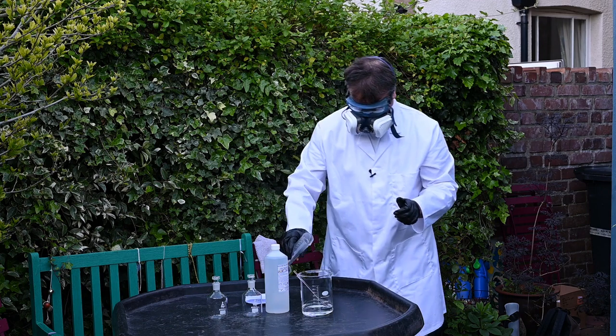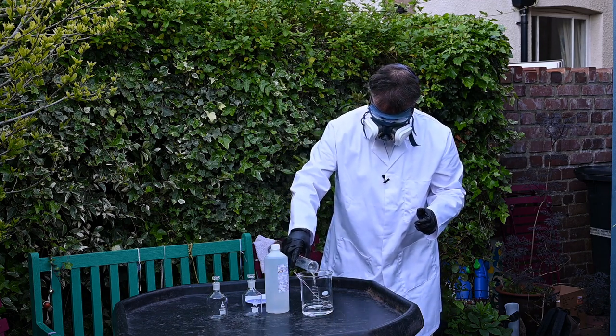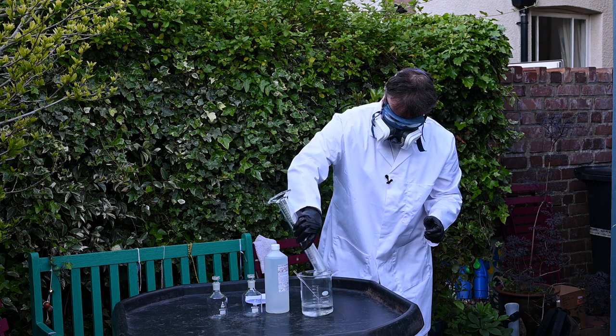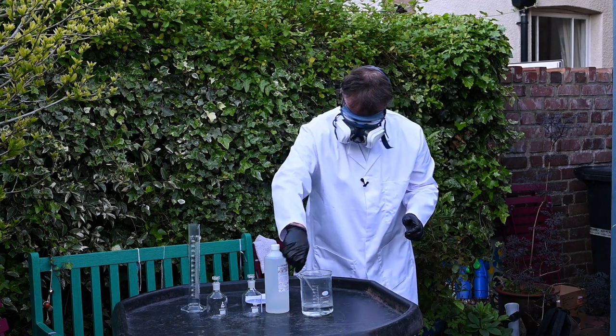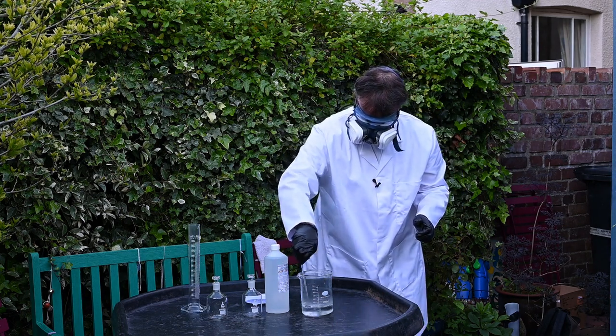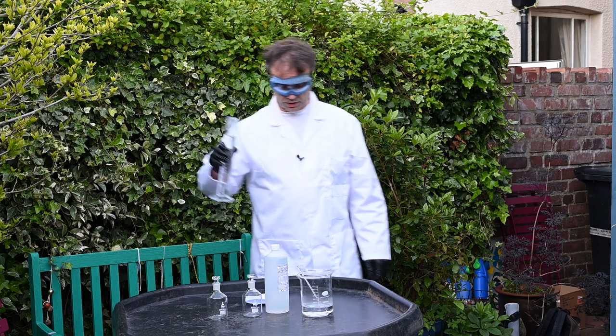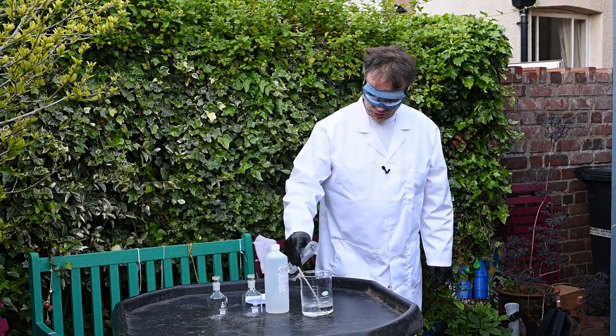Three days later. Finally, we're going to add 250 millilitres of water to make it up to 500 millilitres in total.